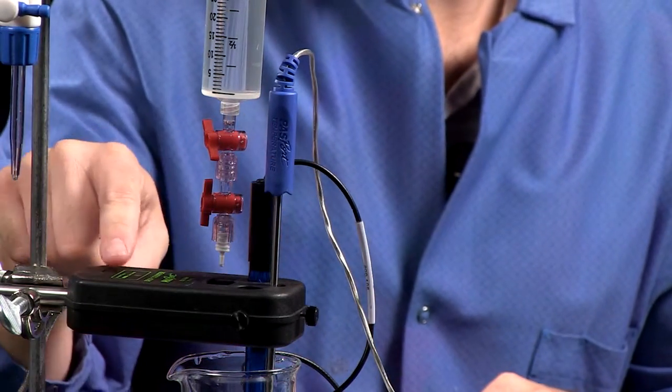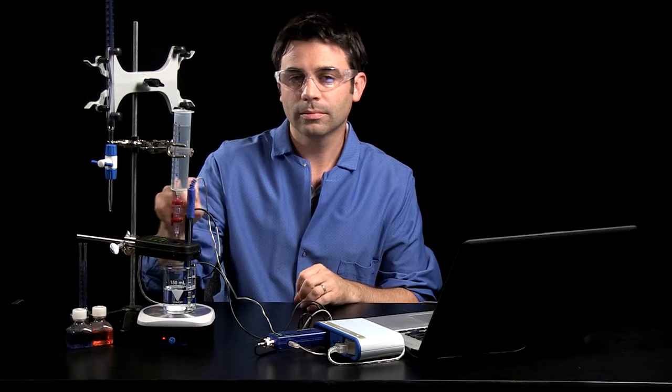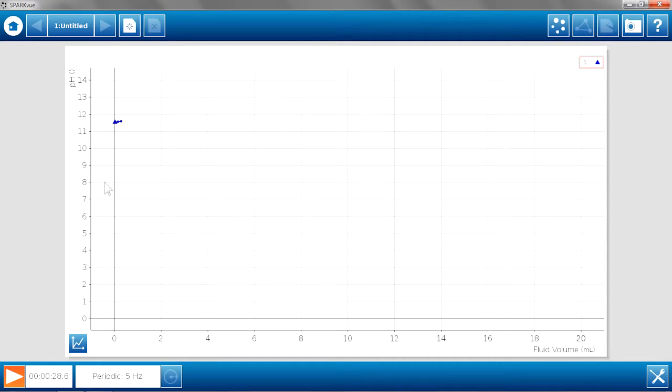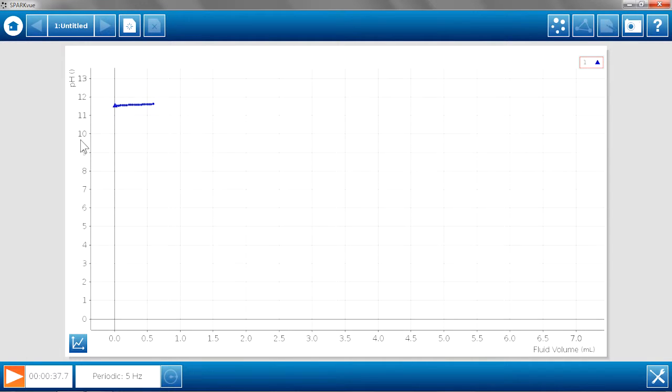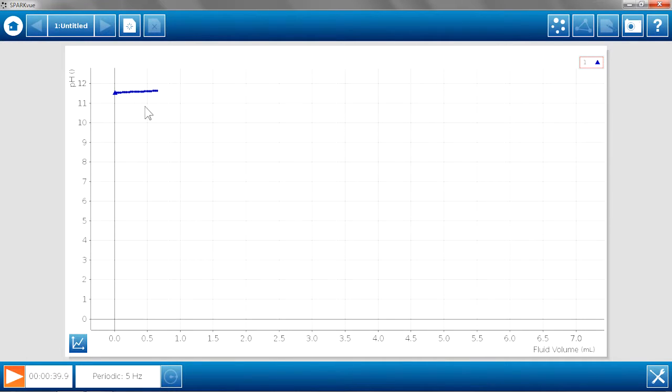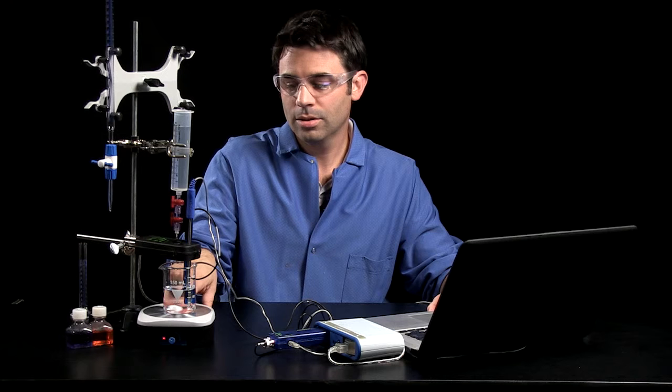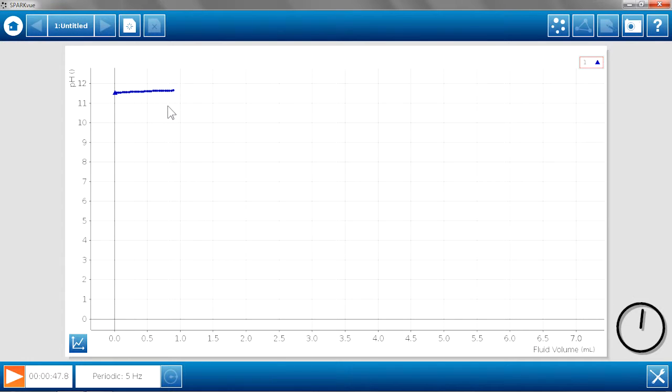And as a drop goes through, the LED light in here blinks so that you know that a drop is being collected. And I'm going to rescale my graph a little bit. Here's my initial pH. Very high because I'm titrating sodium hydroxide with hydrochloric acid. And we'll let this go and see how the titration curve looks.